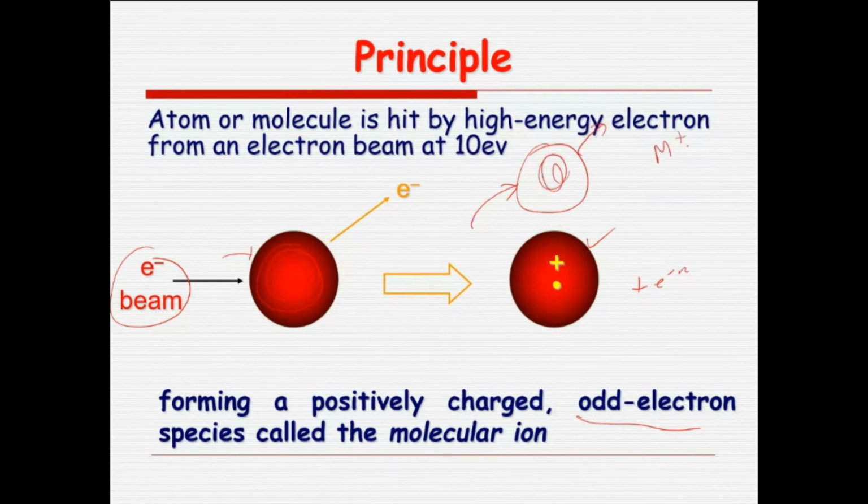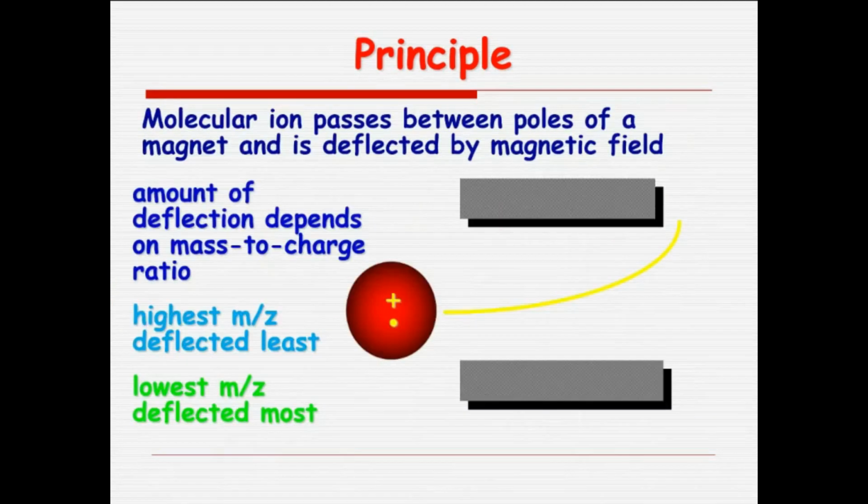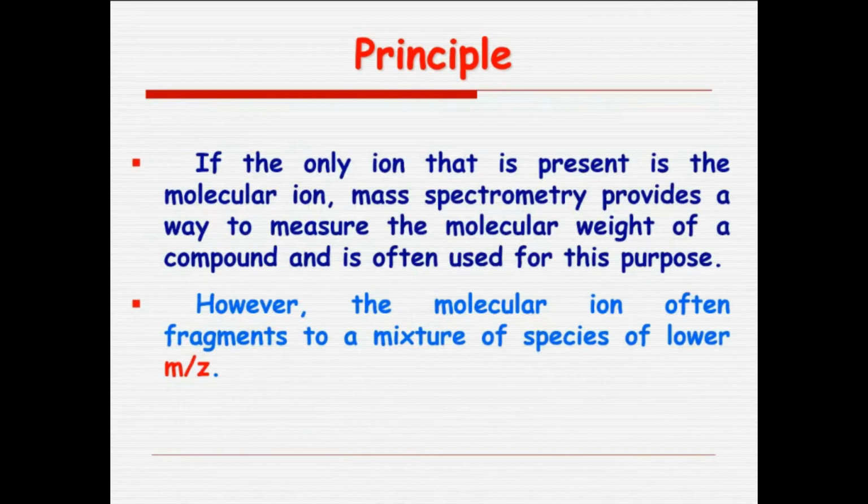Okay, this molecular ion is also known as the parent ion. Now, this parent ion has sufficient energy. It also has sufficient energy to cleave further. So it fragments further, and that is what is known as fragmentation. Okay, so now this molecular ion, not only this happens.